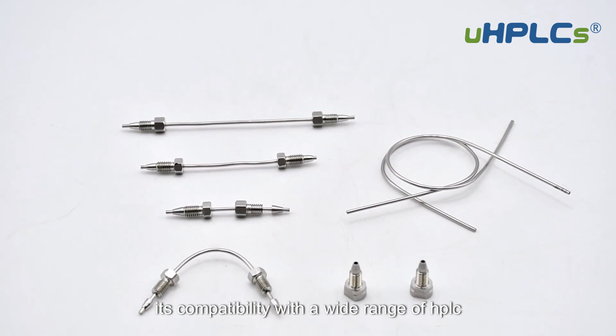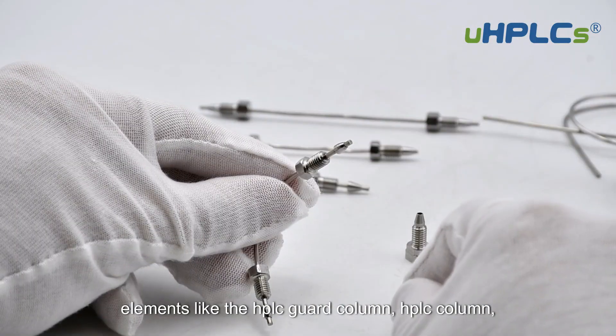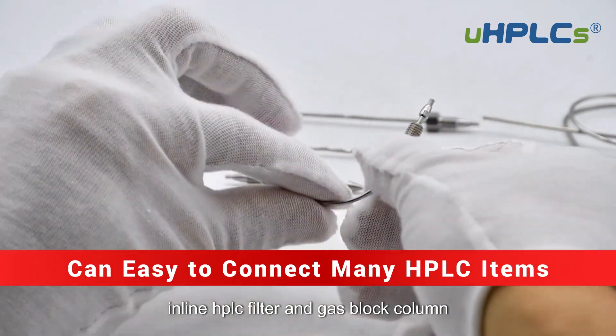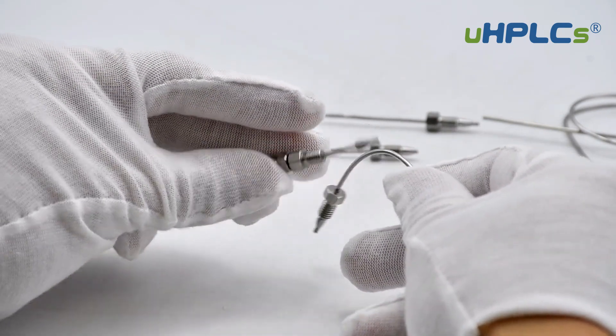Its compatibility with a wide range of HPLC elements — like the HPLC Guard Column, HPLC Column, Inline HPLC Filter, and Gas Block Column — makes it a versatile choice for various applications.